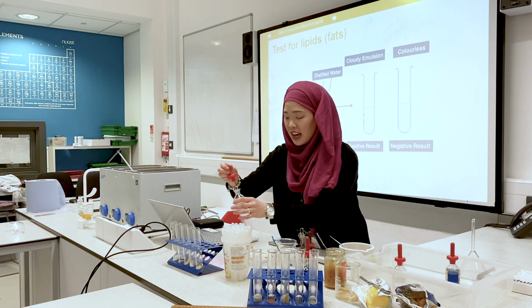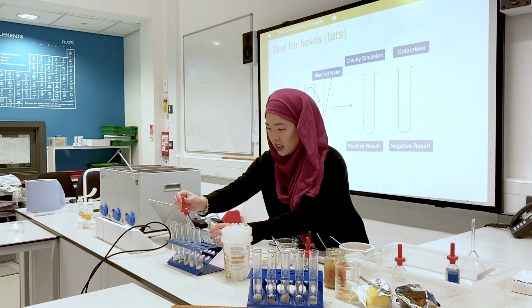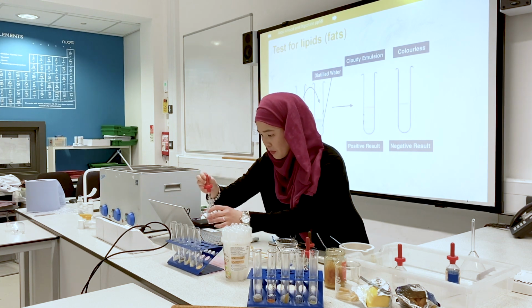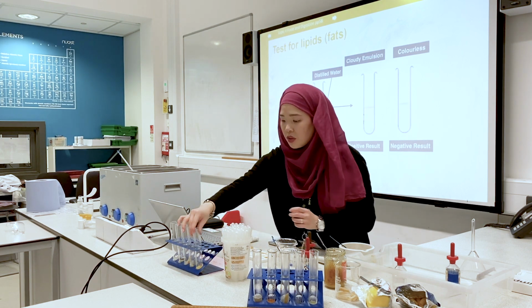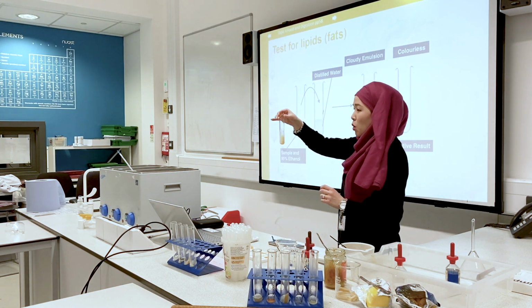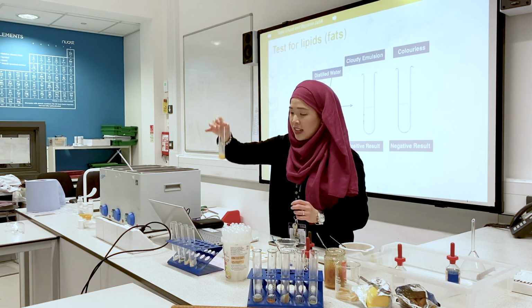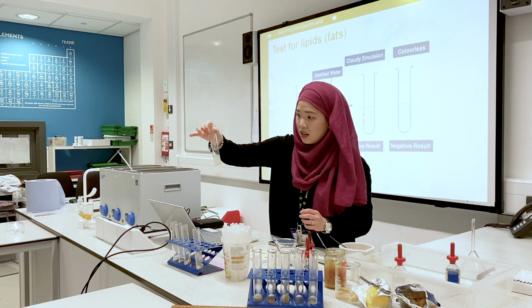So I'm just going to add ethanol to each of the test tubes. I'm going to give them a shake to see if we will end up with a cloudy emulsion, because the lipids or fats present would separate within the test tube.